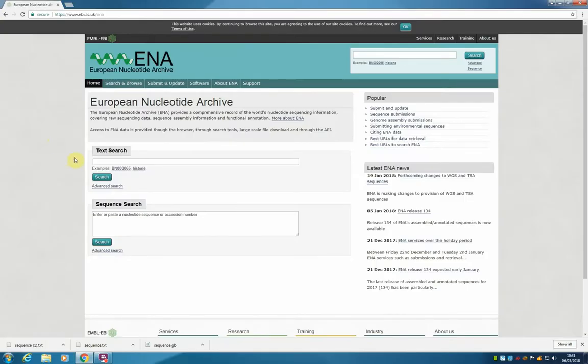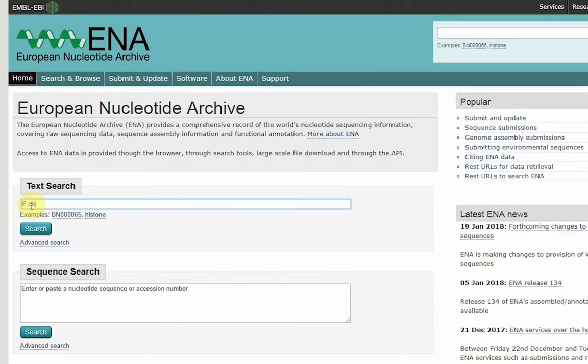This is the search site. In the text search, we are going to type exactly the same thing, E. coli HPCC. And we are going to click search.